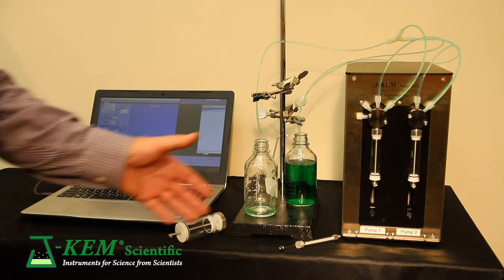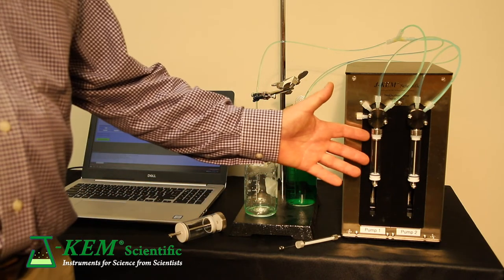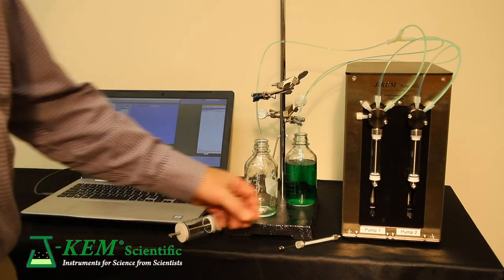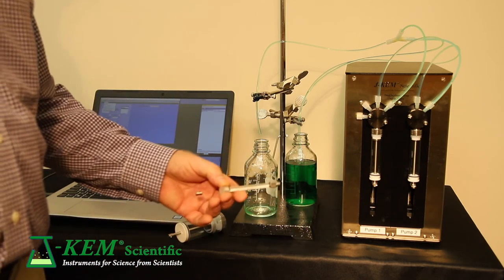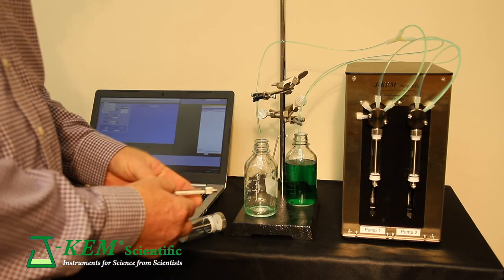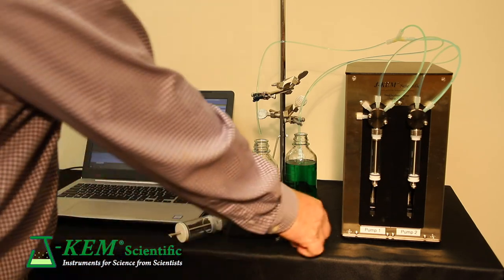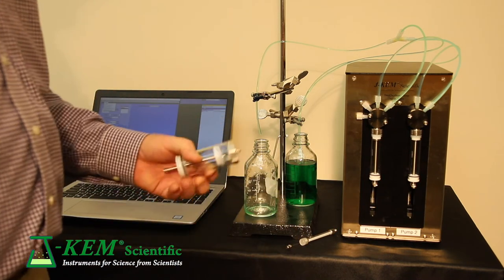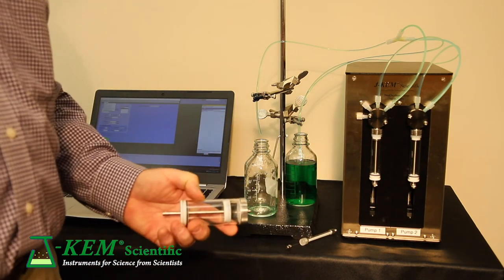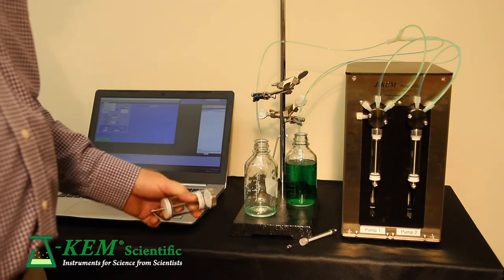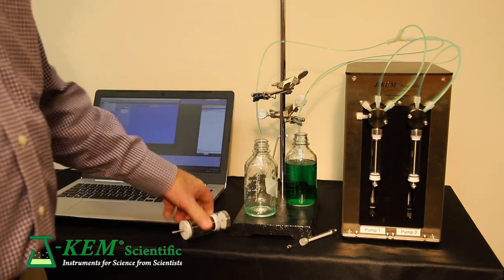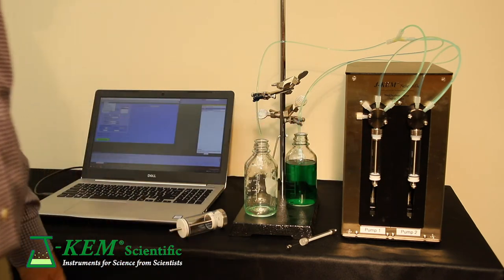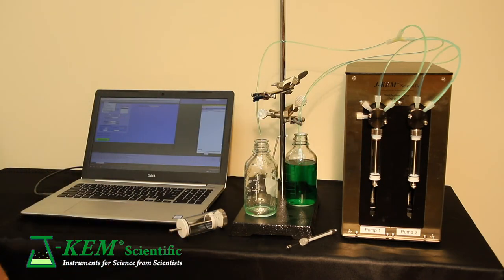The syringes themselves are glass and teflon and they come in a variety of sizes. Anything from a 10 microliter syringe up to a 50 milliliter syringe you can put on here. In this case, I have this fitted with a 10 milliliter syringe.